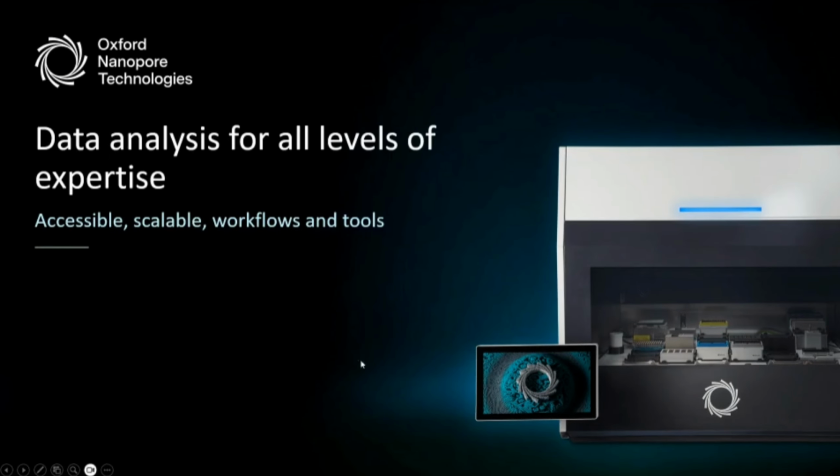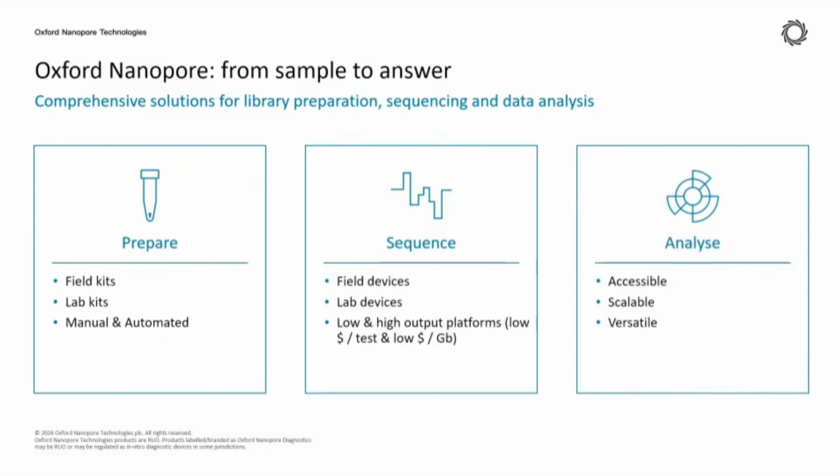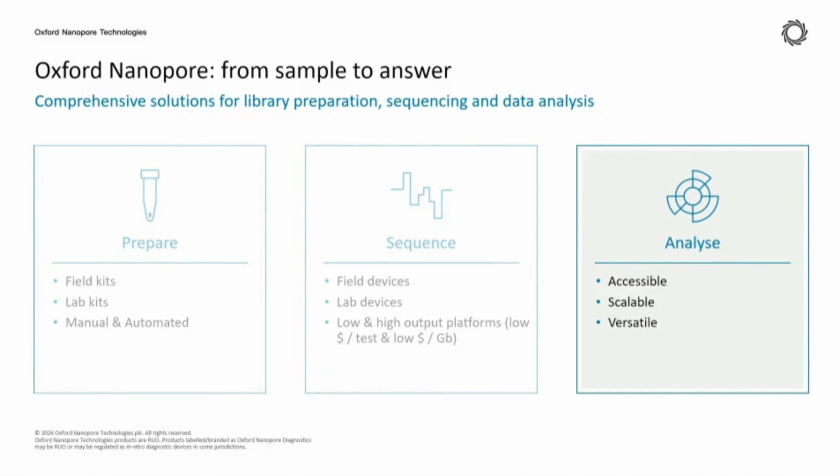Before I go into analyzing the amplicon sequencing data, let me quickly introduce the solutions available for data analysis that were developed by ONT. The software basically helps us with the third step of projects, the analysis part.